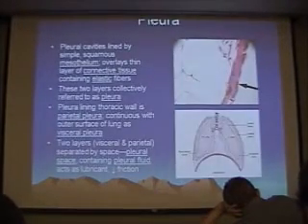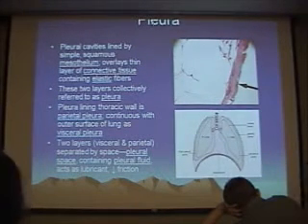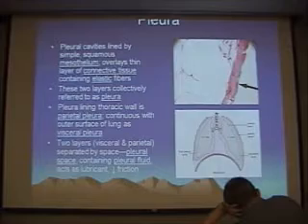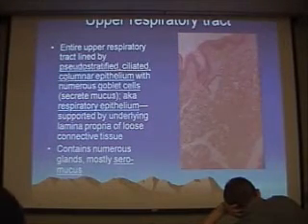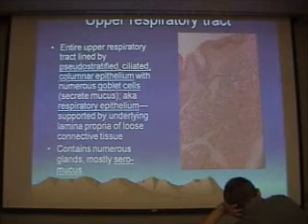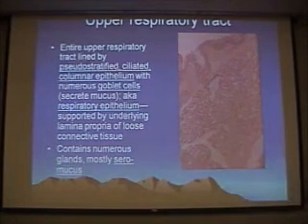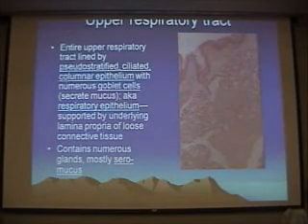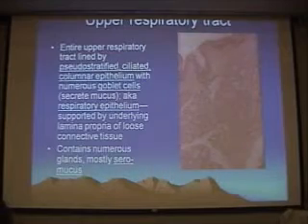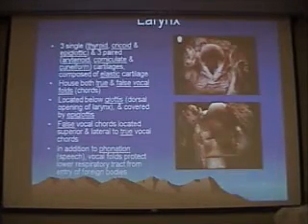That brings us to the respiratory system. So the pleura, it's lined by mesothelium. Upper respiratory system is lined by pseudostratified ciliated columnar epithelium. You should know what that looks like. It has numerous goblet cells within the epithelium, and also abundant seromucous glands within the submucosa or lamina propria, which are of course providing a mucus layer that is carried on the cilia of the ciliated epithelium.